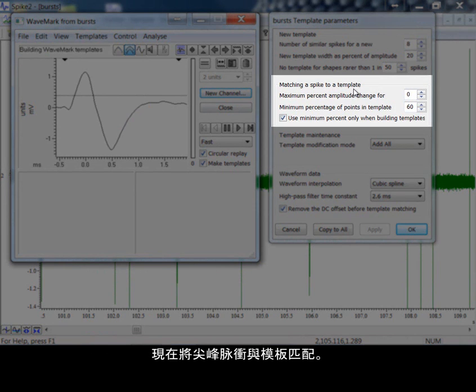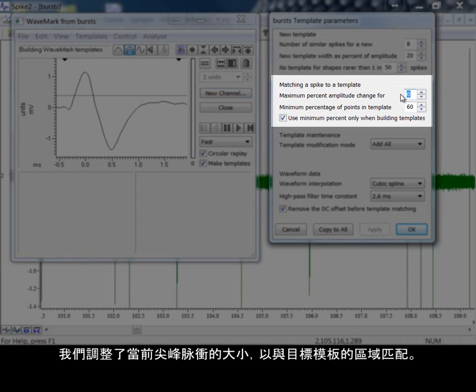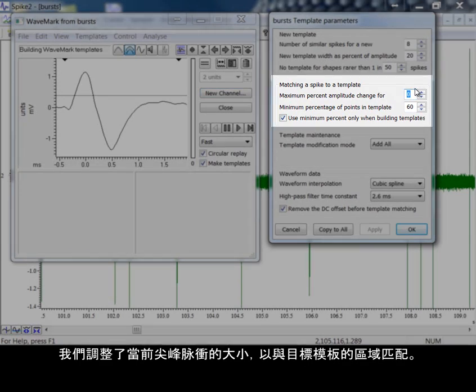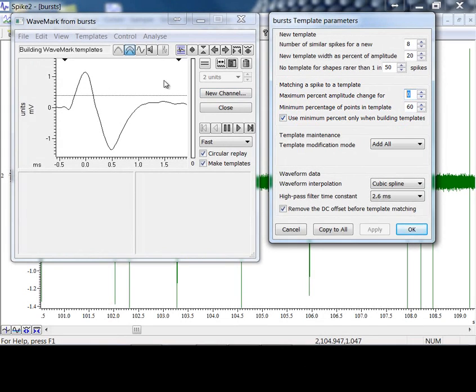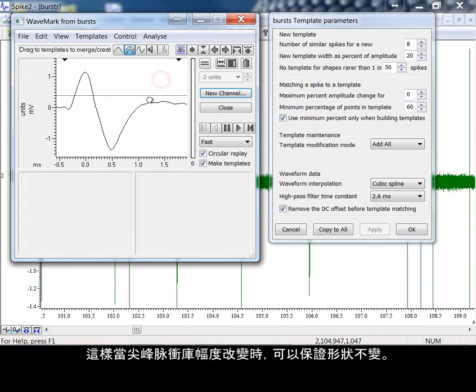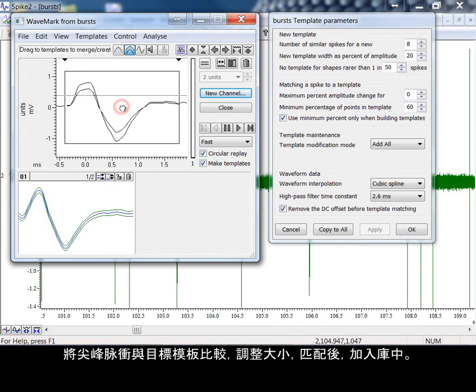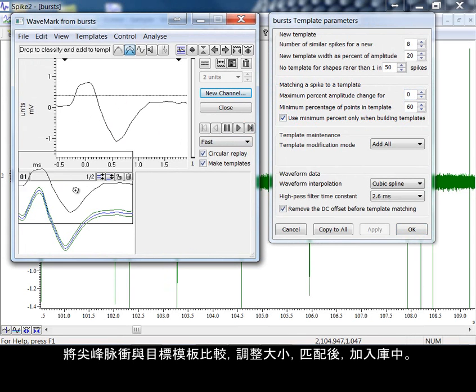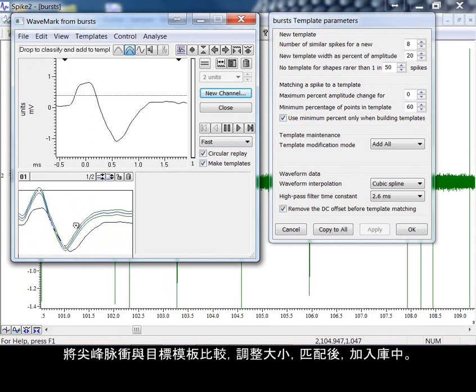Matching a spike to a template now. We can scale the spike currently under consideration to help match the area of the target template. This helps if the spike class changes in amplitude and not shape. We scale the spike up and down comparing it to the target template, and if it matches we add it to the class.